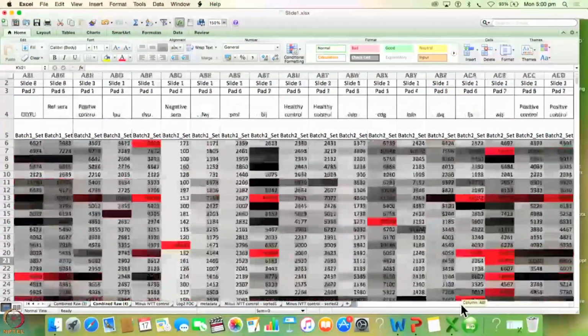For this I am only going to show you the steps. The first thing we do is set a floor of 100. What we are saying here is that all the samples which are below 100 are going to have a value of 100. This is going to remove all the negative values from my data. That's the first thing, and I have done it here for you, and we are going to keep scrolling right.